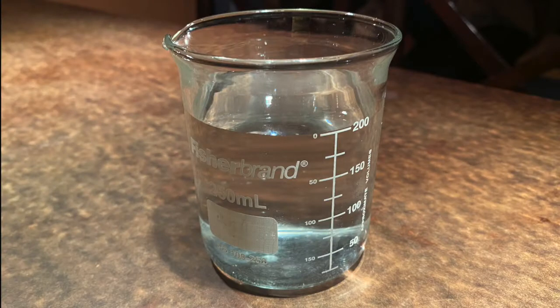Another issue you should think about is establishing some safety limits on the experiments themselves. Concentrated solutions of alkaline hydroxides are extremely corrosive and dangerous to skin and eyes. So I've also decided to limit the concentration and amount of alkaline hydroxide to levels that'll be easier to handle and neutralize, and they'll be less hazardous if there's a spill. Basically, by limiting alkaline hydroxide concentration, I get a passive failsafe on how bad a spill could be.